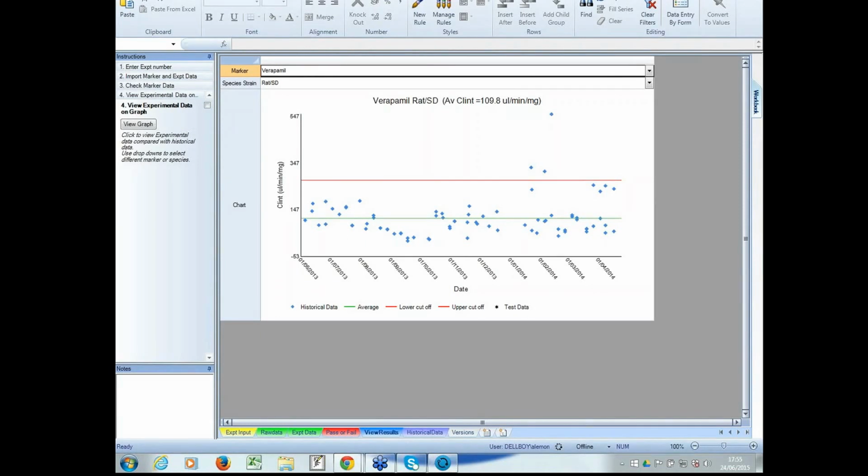And that's the advantage of using this analytics environment with a structured data store like BioRails. So yes, you can fully take advantage of all your historic data here and query it and then bring that into the context of the current experiment.